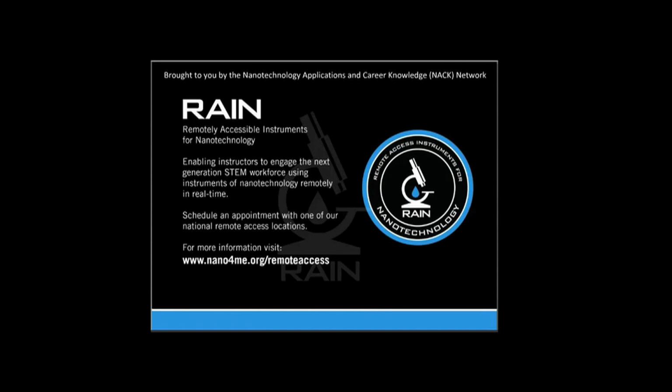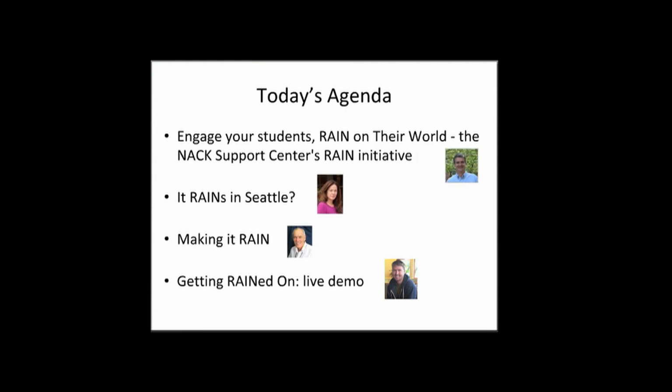Many years ago, we had a vision to bring the nanoscale directly into classrooms via the nanoscale instruments that we had available here at Penn State, and through the program that was the genesis of this center in Pennsylvania, to allow remote participants to see the nanoscale and remotely control our instruments. This page is one of our advertisements showing that our vision is now being realized and is still a work in progress, and that you can indeed bring the nanoscale into your classroom. We're going to talk a lot more about how to do that later on.